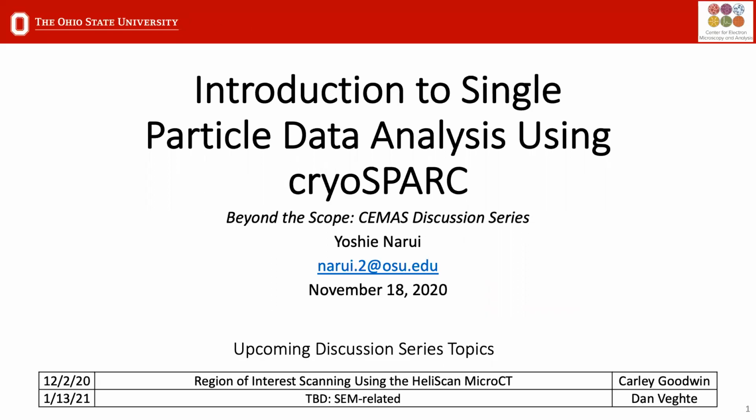It takes a little bit of time. Actually, I don't think it even gives you a visual of it. But if you look over here, what you can see is we started with 20 micrographs, and then it picked all the particles. The total number of particles it extracted was 10,960. So from those 20 images, now we're left with about 11,000 particles.